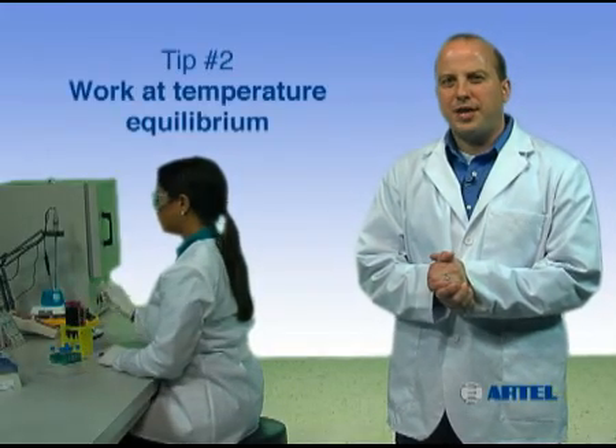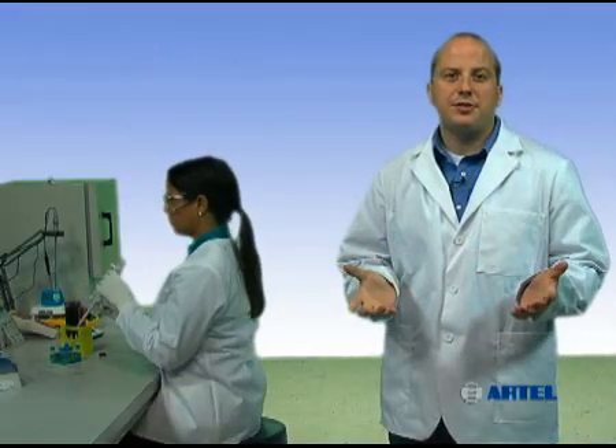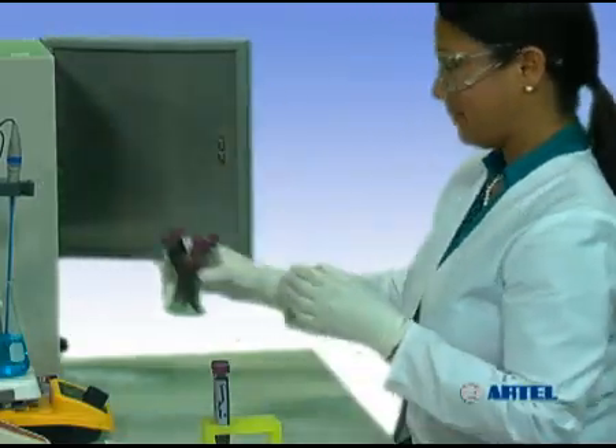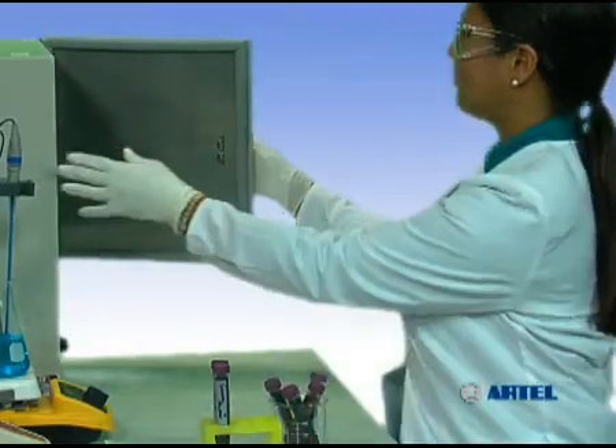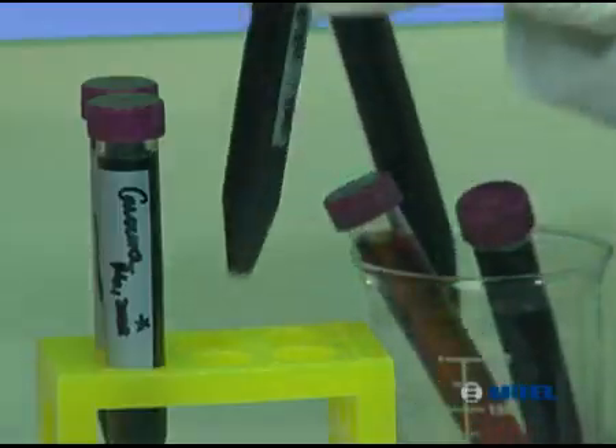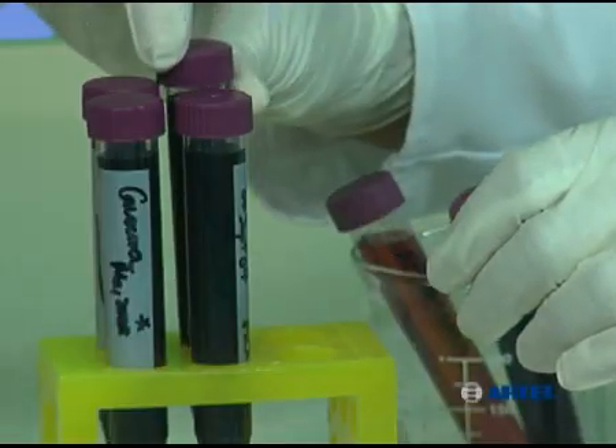The volume of sample delivered by a pipet varies with environmental conditions such as the room temperature of a lab. So before use, allow liquids and the pipet to equilibrate to ambient temperature. Time needed to equilibrate will depend on the starting temperature of the solutions and the amount or quantity of liquid in the container.